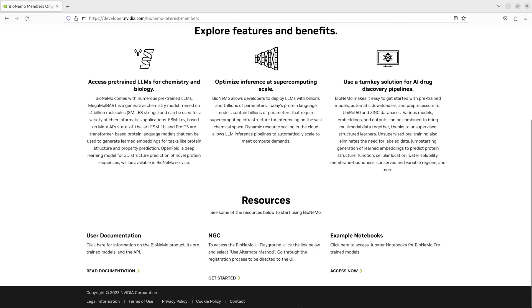In this video, we'll explore the virtual drug screening workflow provided in the NVIDIA Bionemo GitHub examples.